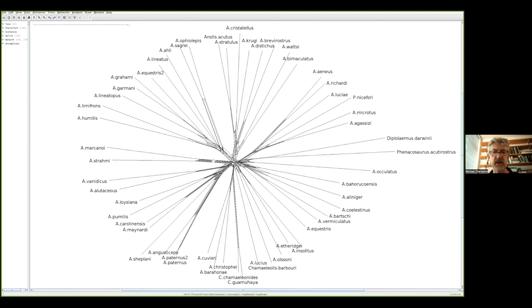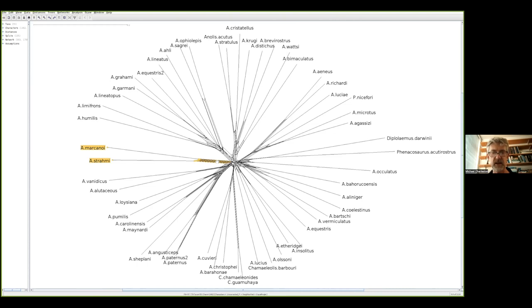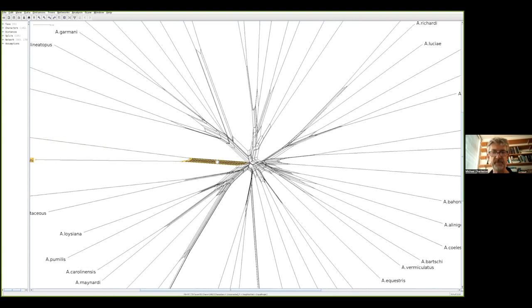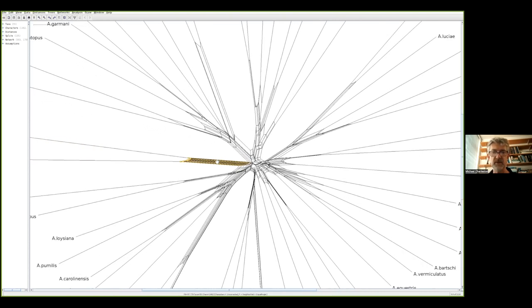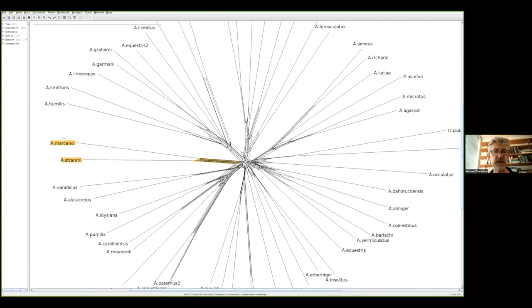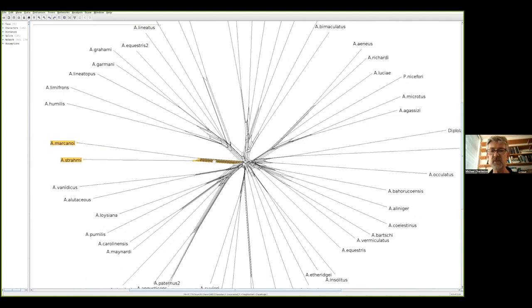You might have noticed there are long rectangles and short fat rectangles. Each of the long thin rectangles I can zoom in on. This set of parallel lines corresponds to a split, a separation of these two taxa here, A. macanoi and A. strami, versus everything else.